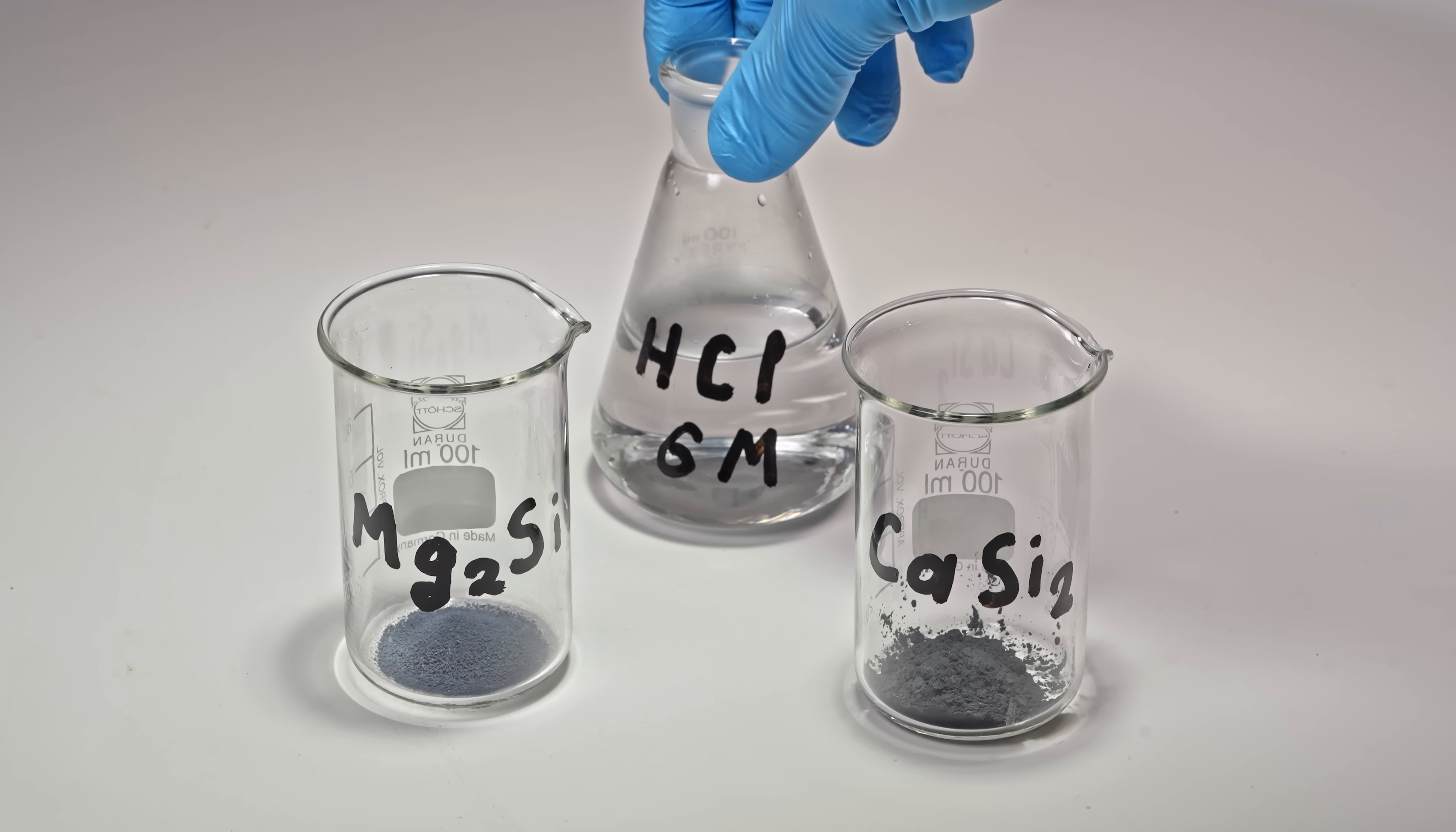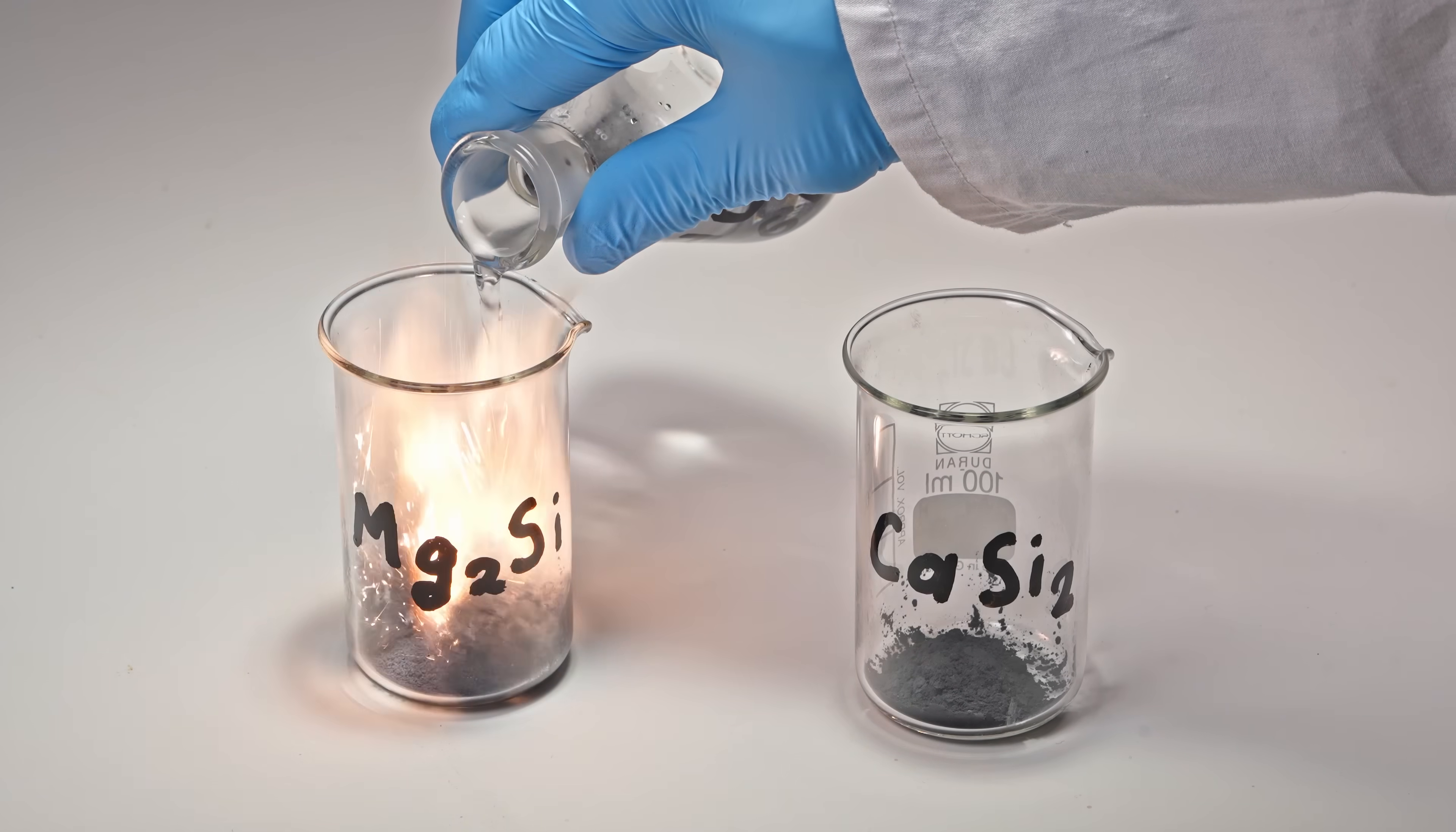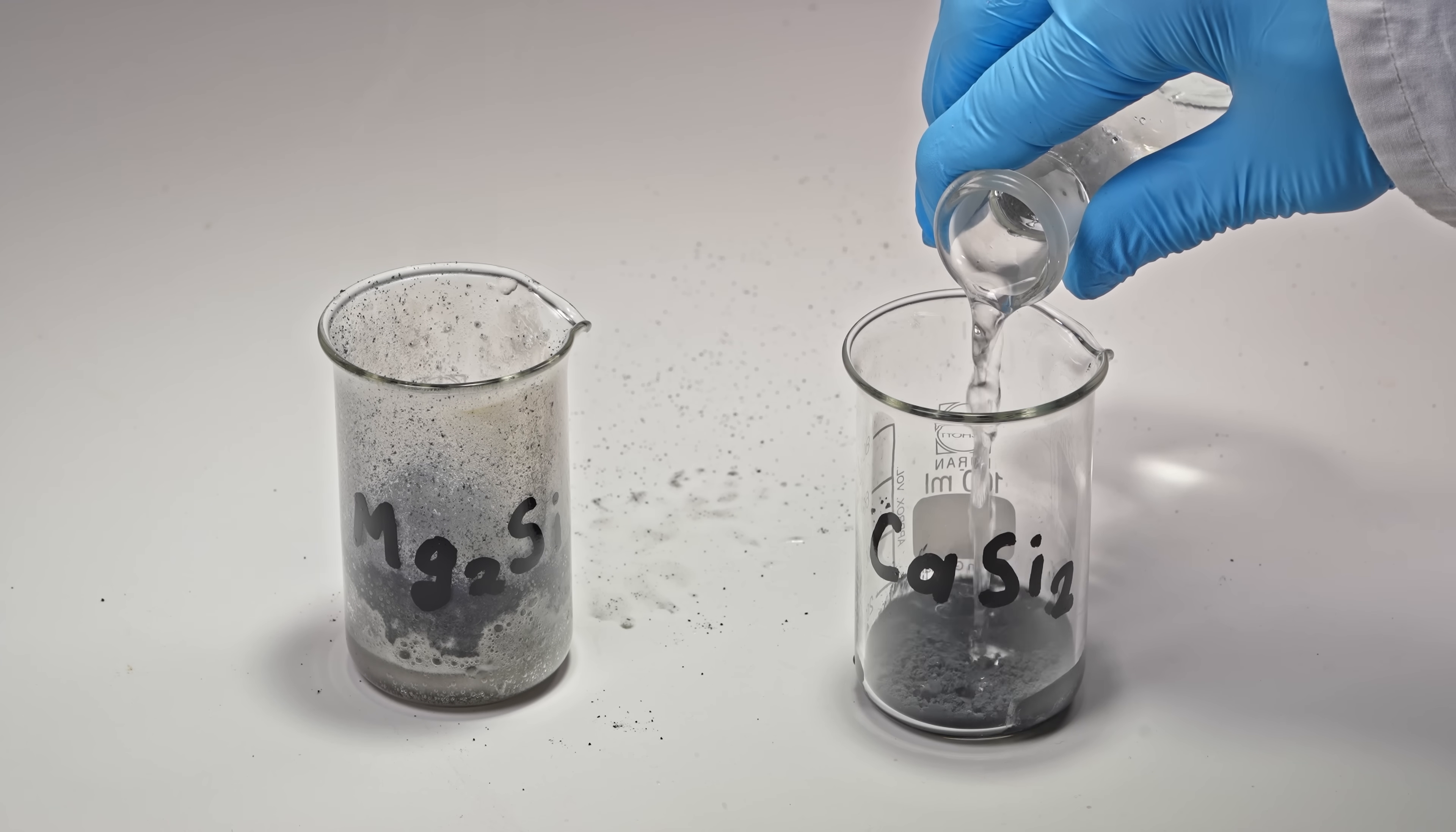At first, these substances look like they should act the same, but they don't. If I add hydrochloric acid to magnesium silicide, it makes a quick flash of flammable silane gas. But if I add the same acid to calcium disilicide, there is no flash.